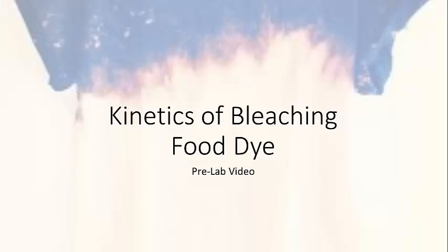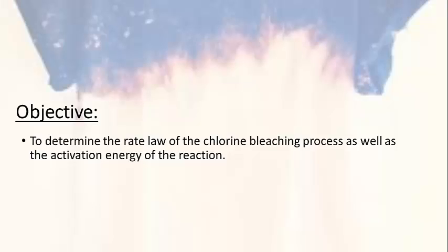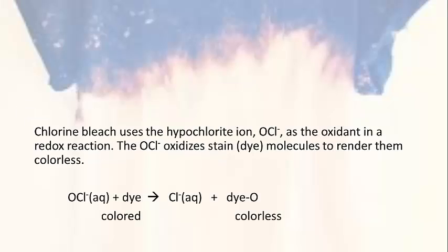This is the pre-lab video for kinetics of bleaching food dye. Our objective in this lab is to determine the rate law for a chlorine bleaching process, as well as what the activation energy is for that reaction.